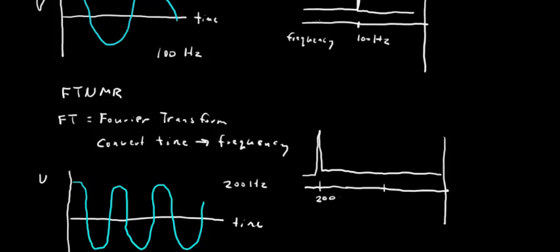And I'll talk more about this with regard to the two most common types of NMR spectrometry or spectroscopy in the next two videos. The next one will be on proton NMR specifically, and the specific types of information we get from proton NMR spectroscopy. And then the second one, really the third video on NMR, and the last one will be on carbon-13 NMR, which is a little bit different but largely similar.